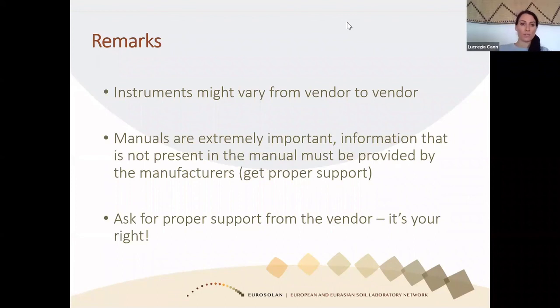There is a question from Tembinkozi. So Tembinkozi, please unmute yourself. Hello, good afternoon. I want to ask if we have the attenuated reflectance IR instrument and also a diffuse reflectance IR instrument, is there a significant difference if you have to use any one of the two?